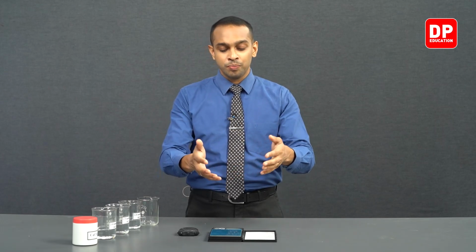Now, this is because calcium carbonate and HCl, when reacted, will produce carbon dioxide gas. Calcium carbonate, when reacted with HCl, will produce calcium chloride, carbon dioxide, and water. And carbon dioxide is a gas. So this gas will be removed from the system. As a gas escapes the system, you will see the mass of the reaction mixture will decrease. So this decrease of mass can be used to measure the order of the reaction between calcium carbonate and HCl.